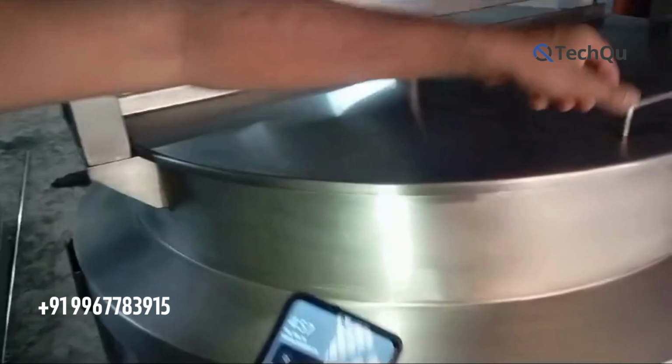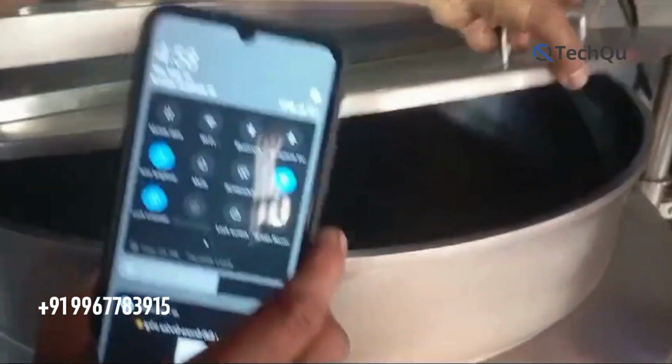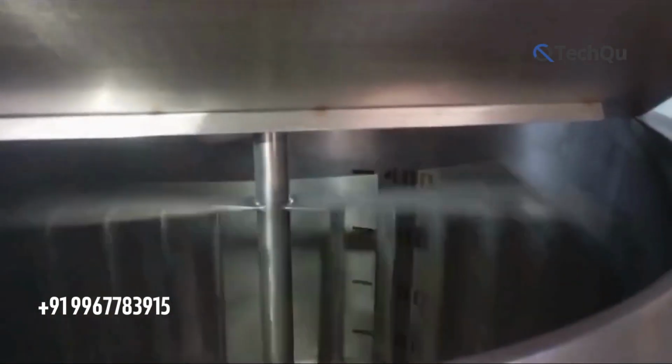The main 3 sections of the ointment manufacturing vessel are: first section, the ointment manufacturing vessel has 3 shells. The inner shell contains the product, the intermediate shell contains dimple plates, which we heat, and the outer shell contains insulation. It reduces heat loss by insulating.